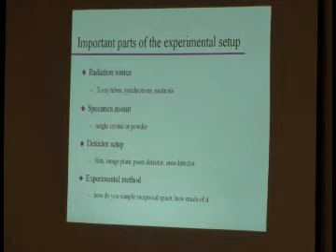What kind of detector are you using? There are a lot of options. Film is one of the oldest ones, image plates, point detectors, area detectors. Now obviously anything that detects more than one reflection at a time is faster. So there's a speed difference between these detectors.